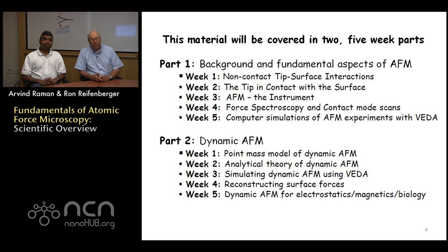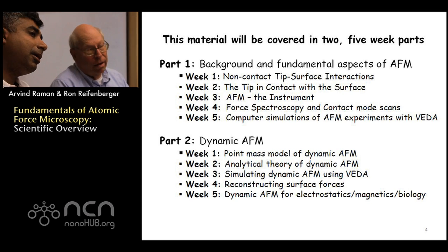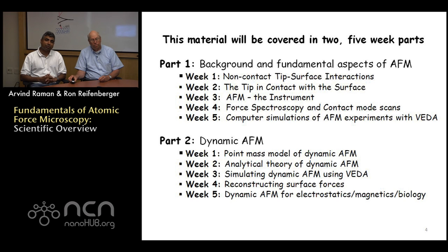And then lastly, interleaved between these 4 weeks of lectures, we'll discuss computer simulations of AFM experiments, focusing largely on the static cantilever using this tool VEDA that Arvind and his group has developed here at Purdue. And in part two of the class, we're going to focus on dynamic atomic force microscopy methods, which have been chosen to be the focus of the second part because dynamic AFM methods tend to measure and sense the tip-sample interaction forces in a very different way.